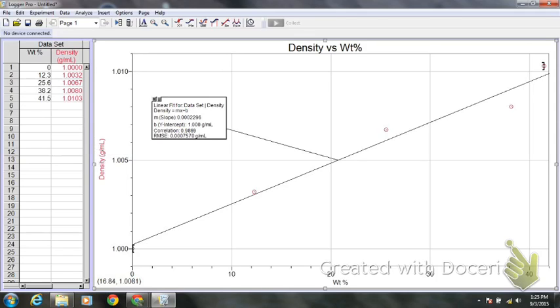Well, plus or minus. So I need to have these labeled, so I labeled those. I need a title here. Okay, I need the points with point protectors. Now one of the things I have students sometimes when they turn in is they have turned on something that I call dot to dot, and you want to turn off that feature. It's also in the graph options. So don't connect these points. Okay, it should look something very much like this. Questions?